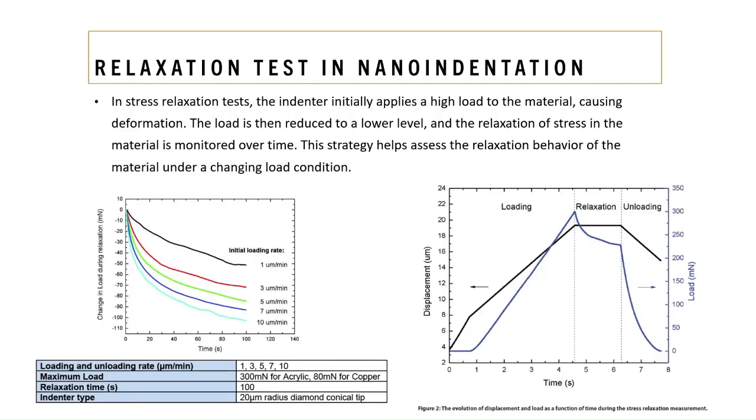And last one, relaxation test in nanoindentation.